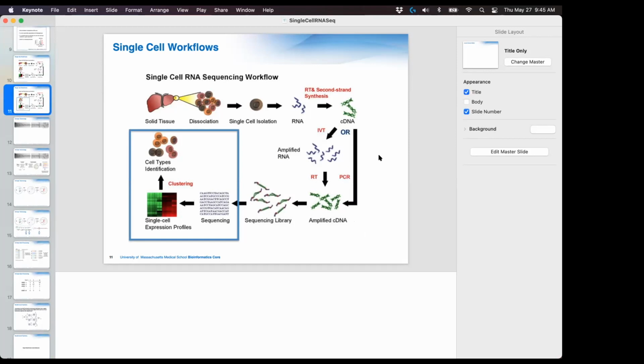What the UMI is for is that if you started with 1 actin beta transcript, it will have 1 unique UMI on it. When you amplify that transcript many times, in the end they'll all be collapsed down to the 1 unique transcript based on that UMI. Does that make sense? So you add the UMIs before the amplification step. Correct.